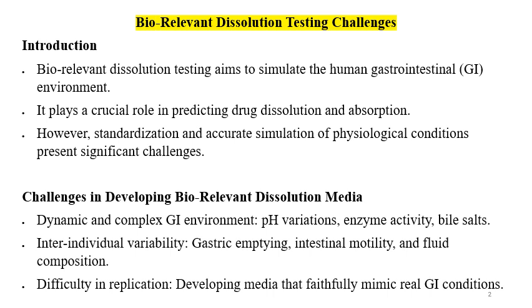Challenges in developing biorelevant dissolution media. As we know, we need media which can simulate the GI fluid. So there is a dynamic and complex GI environment. pH variations, enzyme activity, bile salts are not constant in an individual and among individuals.